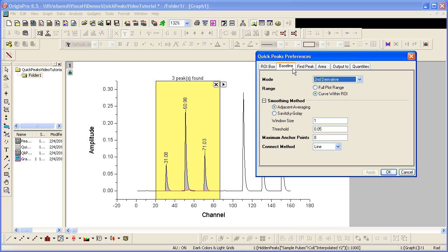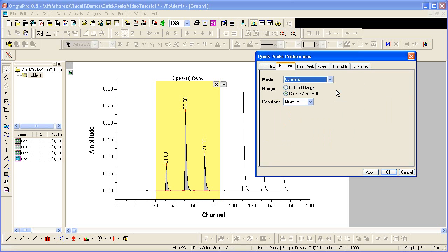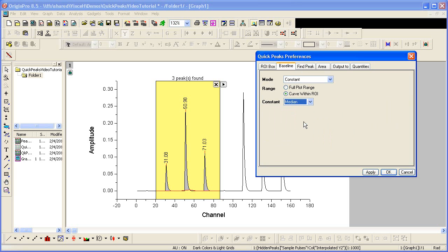I would like to change the baseline from a second derivative method to one that's found with a simple constant. And I'd like to use the median. To see the change, I click Apply.